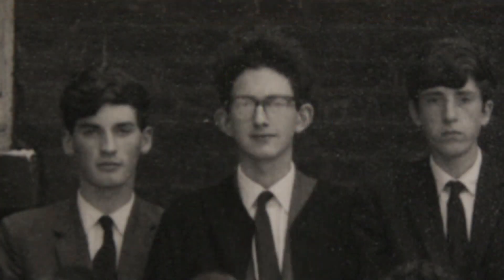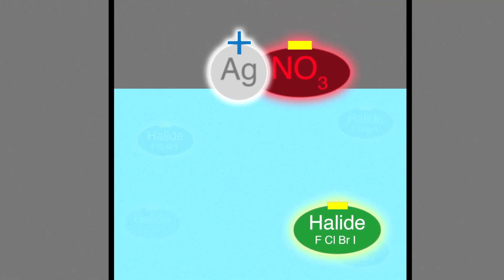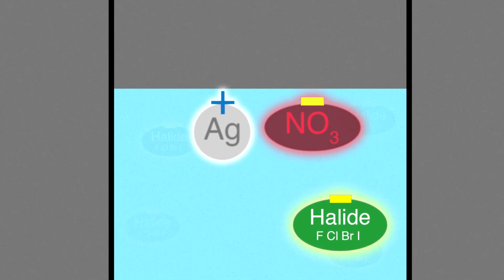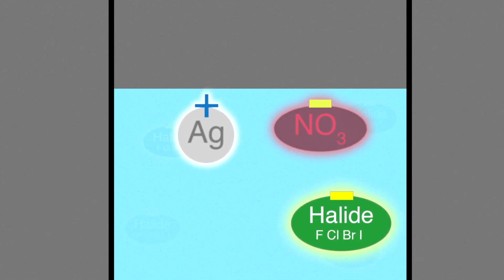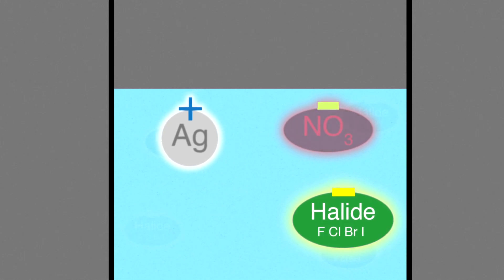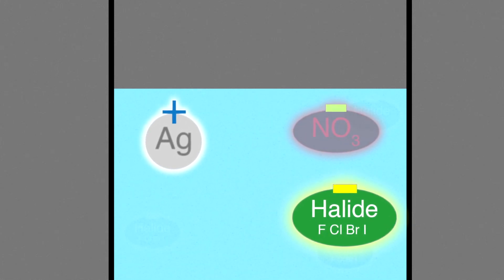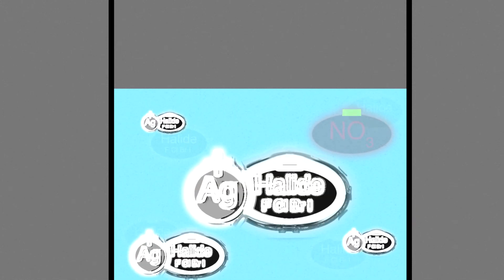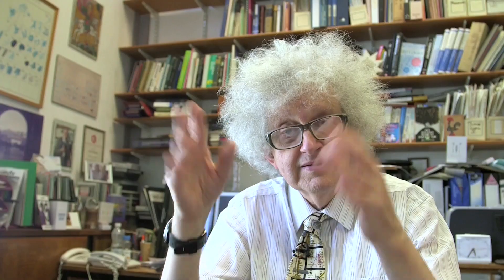These tests look really quite pretty, though when I was a schoolboy I found them really tedious. It involves adding silver nitrate to the solutions and you get a precipitate. When you add the silver nitrate, you get silver ions in the solution which also contains nitrate, but also chloride or bromide or iodide ions. The silver halides are very insoluble, so when the silver and the halide ions meet, they form a solid and precipitate. You get a precipitate of different colours depending which halogen you use.